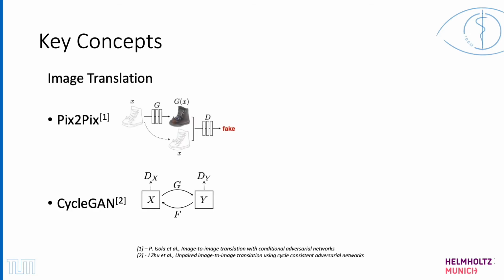Our first step was reviewing existing methods. However, our experiments showed us that these often fail to generate semantically correct images when underlying annotations used for training are noisy. Current image translation approaches, such as Pix2Pix, CycleGAN or CUT, perform image translation of structures that are visible in both domains. However, this is not the case in our application.